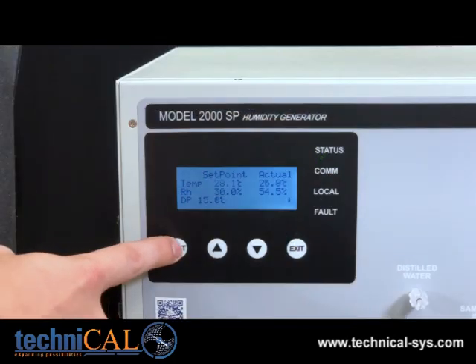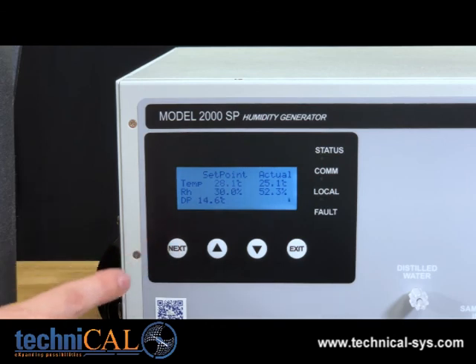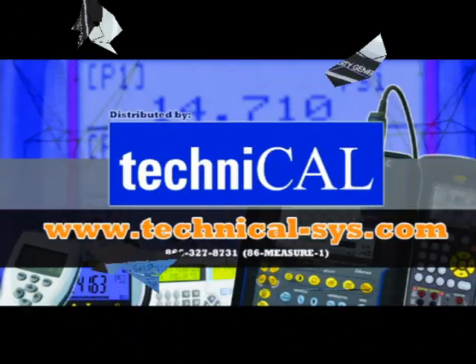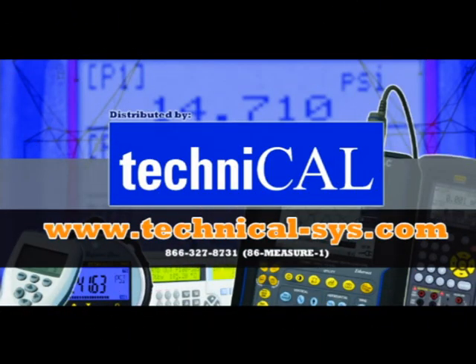At this point, you can move to the controller and press the next button to toggle between humidity and temperature. Once you've selected your field, press either the up or down keys to adjust the unit set points. For more information, please visit GeoCalibration.